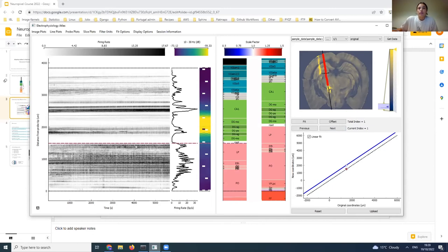Another feature that we can look out for is these high firing rate regions. Typically, these correspond to pyramidal cell layers. From literature, we know that both in the hippocampus CA1 and also in layer five of the cortex, we expect to see these layers. So I can add another couple of reference lines and roughly align them to the middle of the CA1 region, and this one around layer five of the cortex.